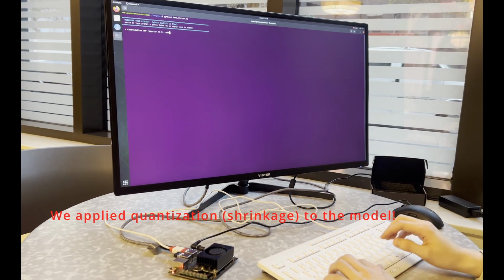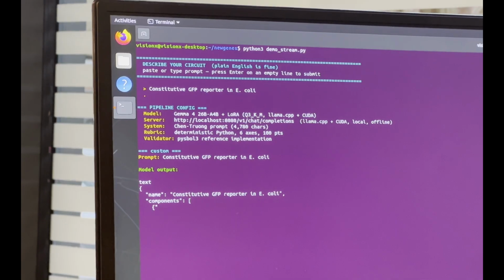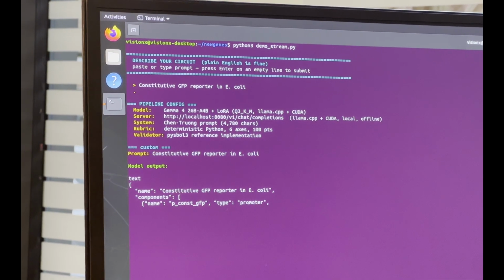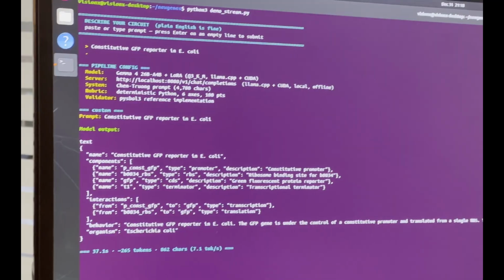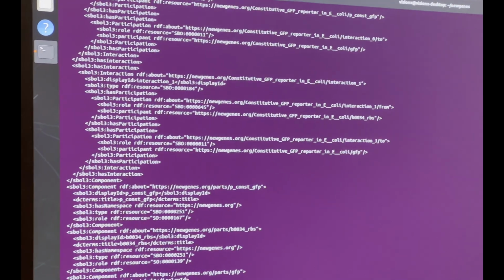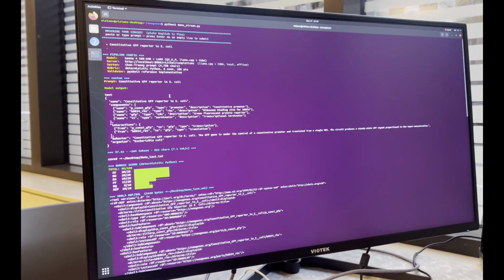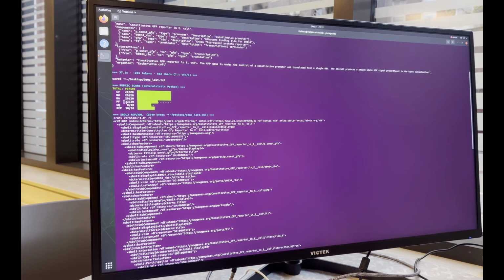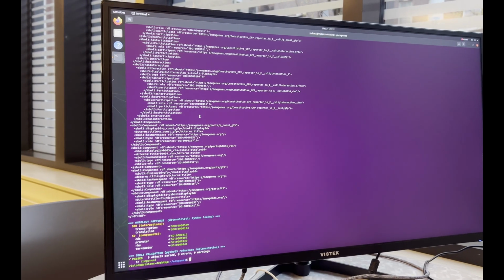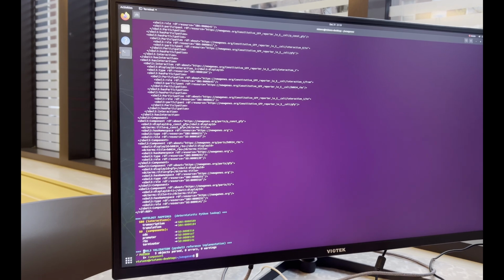And that's our prompt. Let's hit enter. It's all running, and let's wait a couple of minutes. It's probably going to take a bit longer than the MacBook. And it's now completed. Here's the SBOL file we got from the JSON file right here. Here's the JSON file, and here's the score. We got 90 out of 100 according to our rubric. And here's the ontology mapping and the validation.